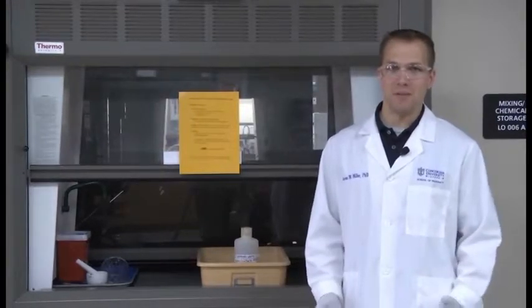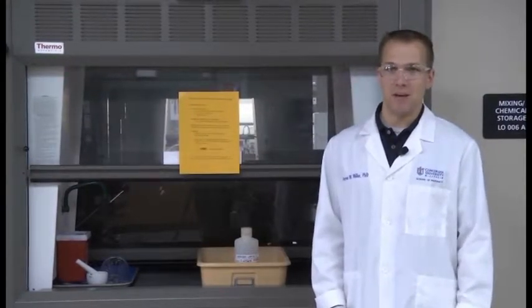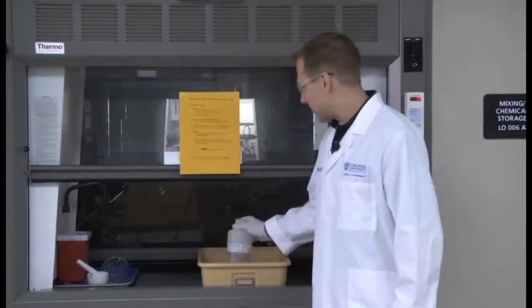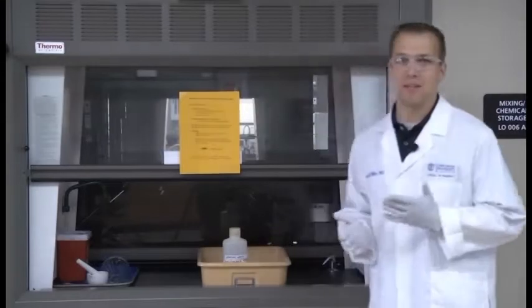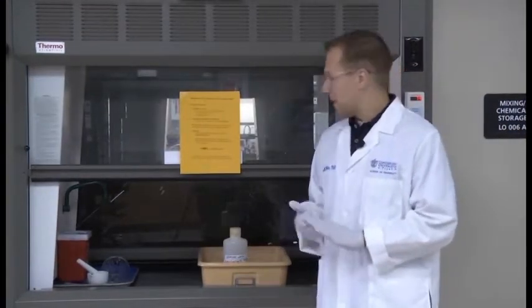Now, if you do know that something has one of these hazardous characteristics and it needs to be disposed of properly, there are a few procedures to follow. Hazardous waste should be collected in compatible containers. That means that it's something that's not going to be damaged by the chemical you're putting inside.